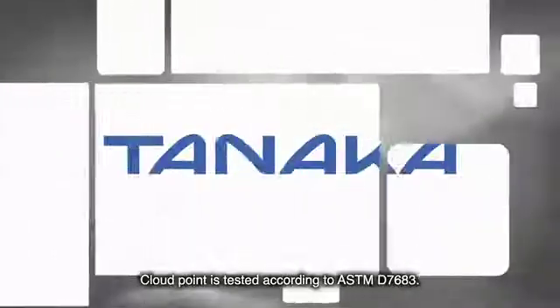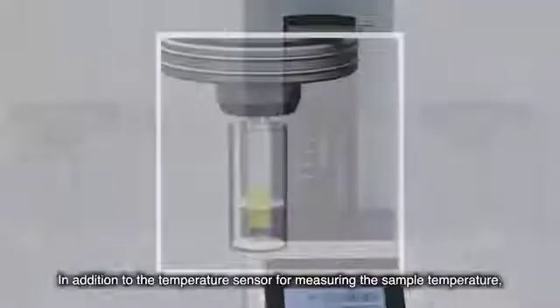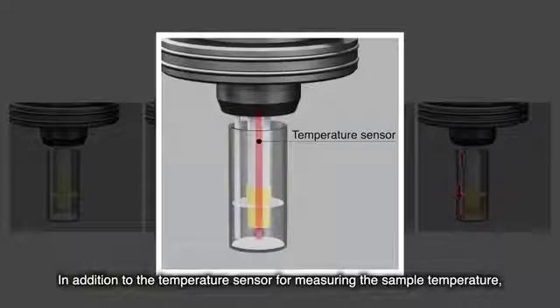The cloud point is tested according to ASTM D7683. In addition to the temperature sensor for measuring the sample temperature, the detector head is equipped with a cloud point detection sensor.